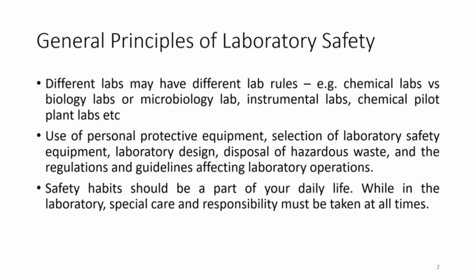But in this segment, we will just be talking about some of the common practices you should be observing when you are working in a lab. Safety habits should be a part of your daily life. While in the laboratories, all users must take special care and responsibility to ensure their safety.